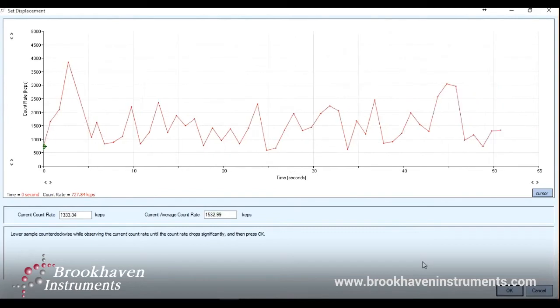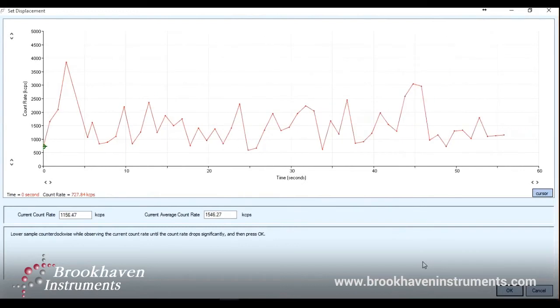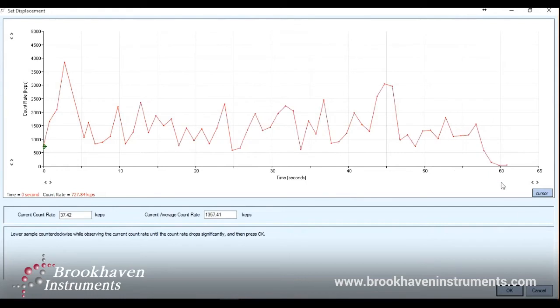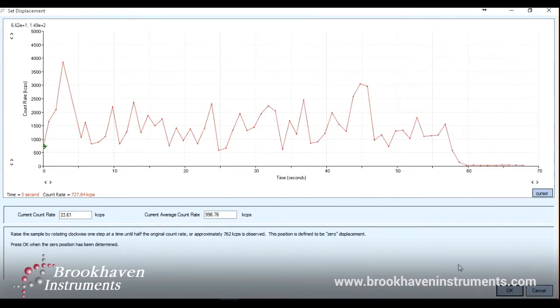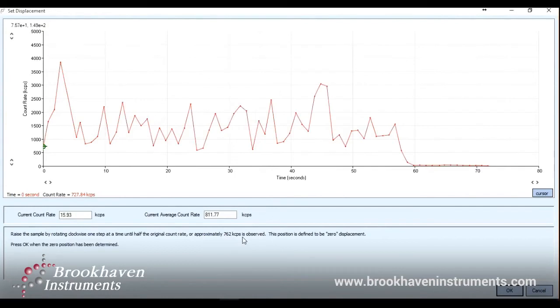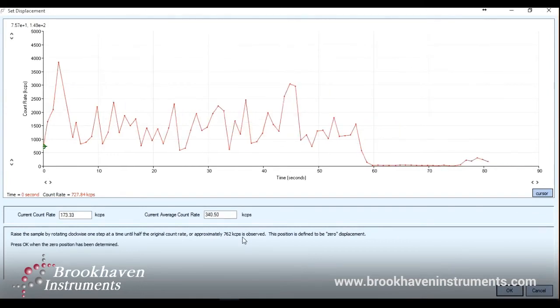Then press OK. The next step is to lower the sample down until the count rate is essentially zero — the whole path of the laser beam is blocked. We do this by turning counterclockwise until we see the count rate drop dramatically. Once we've completed that step, click OK and we will raise the sample up one more time until approximately half of the original count rate is reached. Let this stabilize for at least a minute as well. Once you are confident that the zero point has been reached, we can press OK and follow the instructions for beginning the measurement.